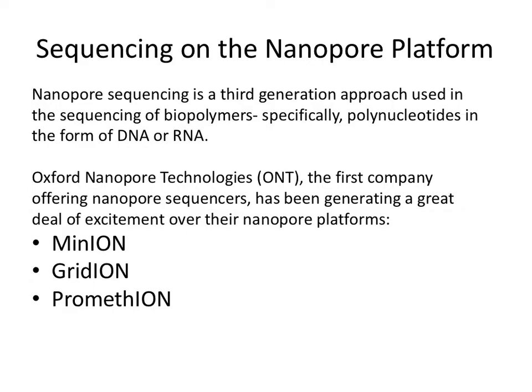Nanopore sequencing. I think in 2010 sequencing was classified into three generations. People who do Sanger sequencing are doing first generation sequencing. If you do the second generation sequencing, that's mostly what Anu and Mark had been talking about, so it's a really good introduction to what we call second generation sequencing. Even when Mark was alluding to the 1000 Genomes, there were four criteria in that. It means sequencing the genome in big pieces rather than short pieces as we do in second generation sequencing. So people are still quite excited about third generation sequencing.